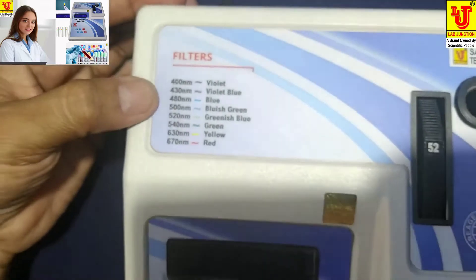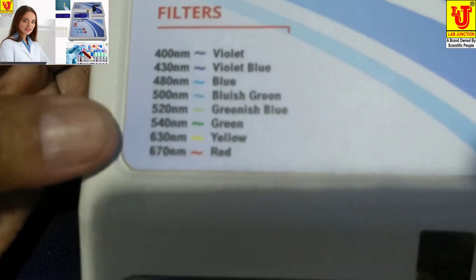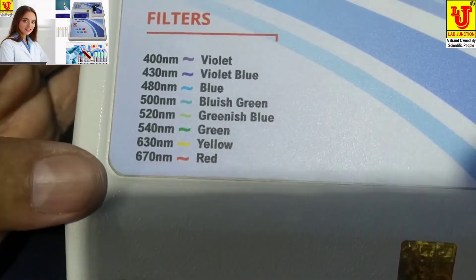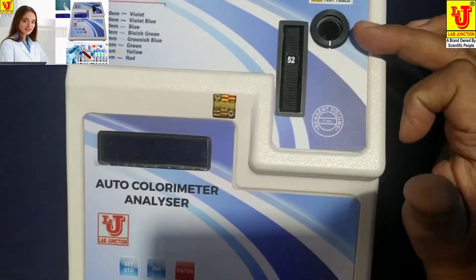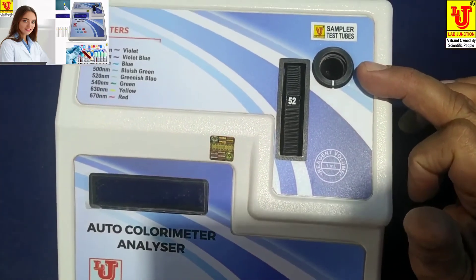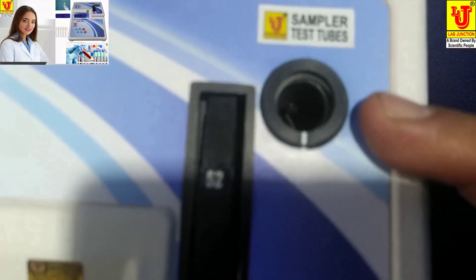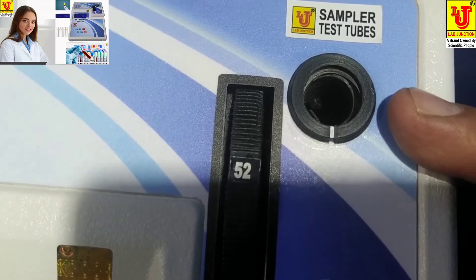The available filter wavelengths are 400nm, 430nm, 480nm, 500nm, 520nm, 540nm, 630nm, and 670nm. This is the sample test tube holder for inserting the test tube with sample.